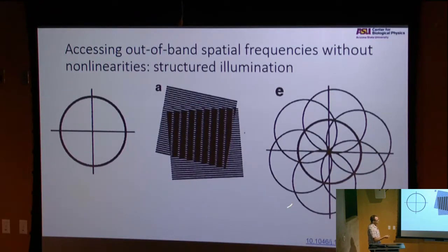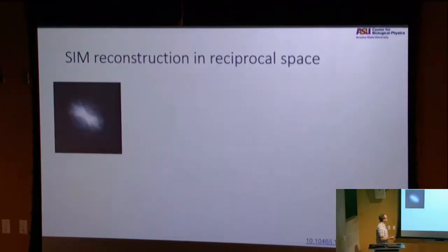If you then change the angle a bunch, you can fill in a much more full transfer function. So in the linear regime, this works out to getting you twice the K-max. You can get twice the resolution. So what does this actually look like?